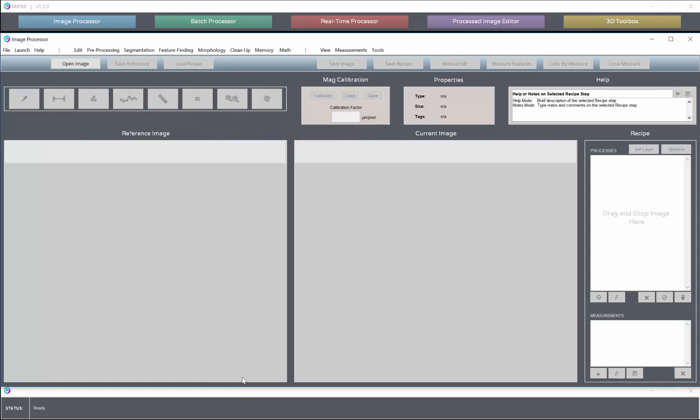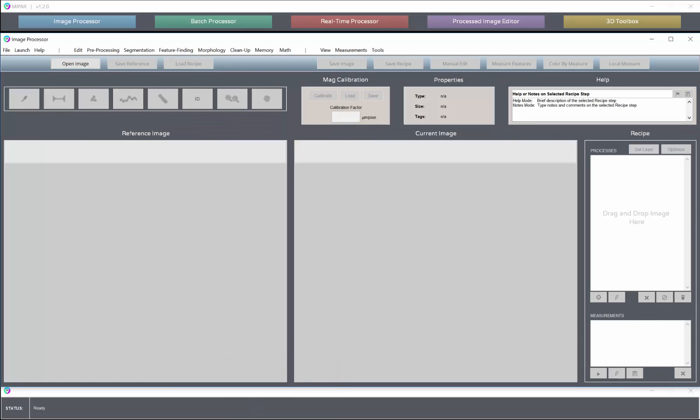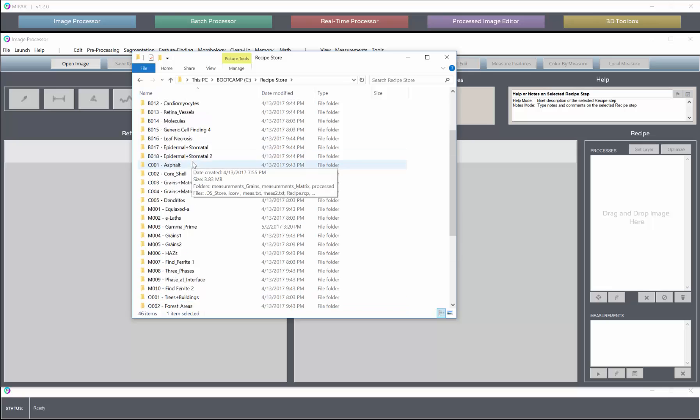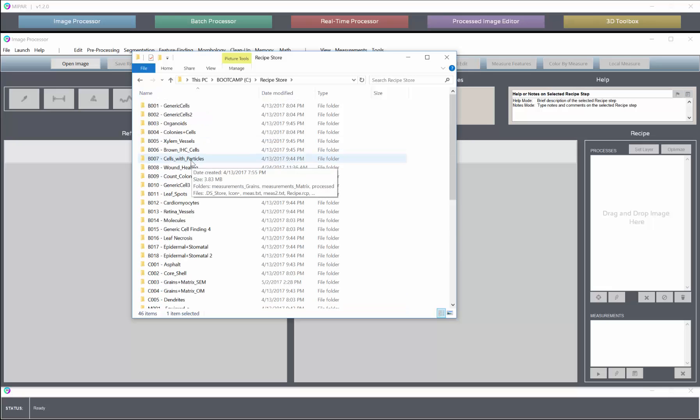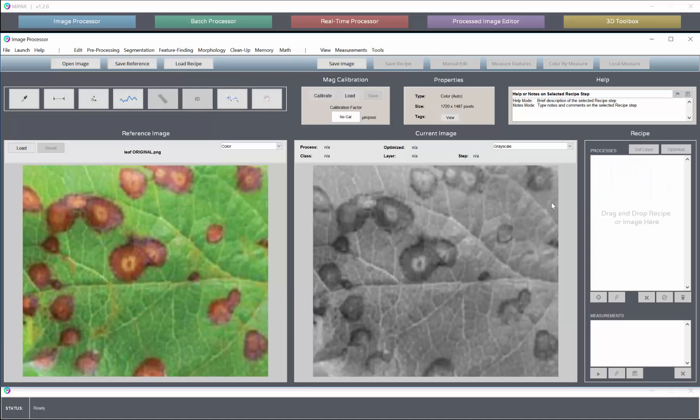So let's begin in the image processor where we will start with a simple two class example. Here we have some disease spots on a leaf.